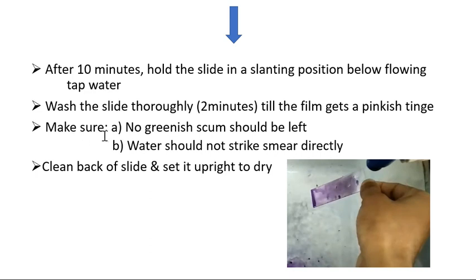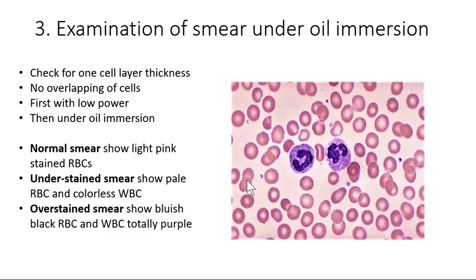Now make sure that there is no greenish scum, and the water should not strike the smear directly. Now clean the back side of the smear and let it dry. So this way we have done the second step, which is staining.